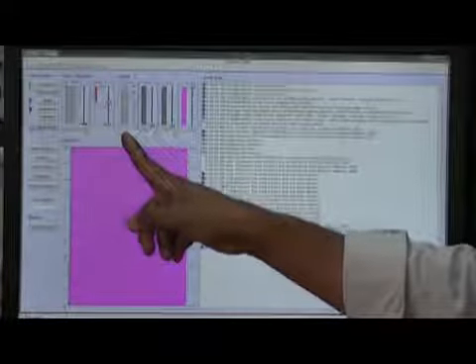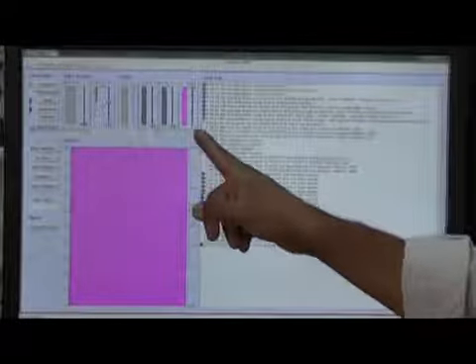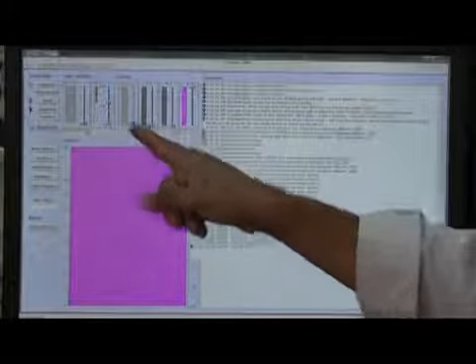I want to make purging of line A. So my line A should be 100%. How will this be 100%? I will put this one 0 and this will become 100%. Zero, enter. Now line A becomes 100%.